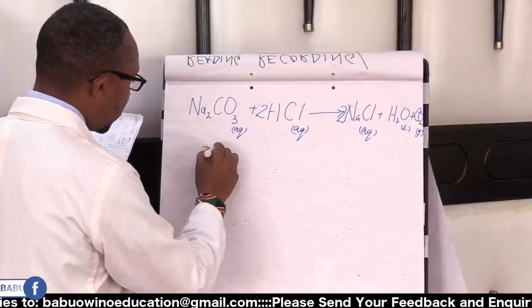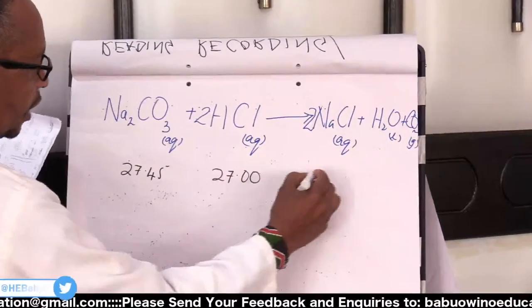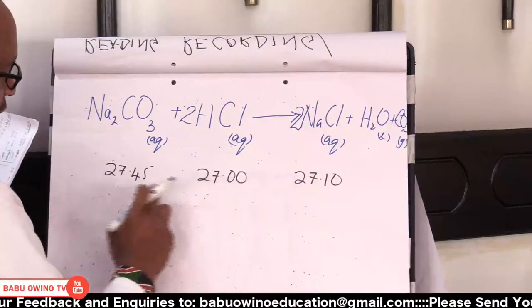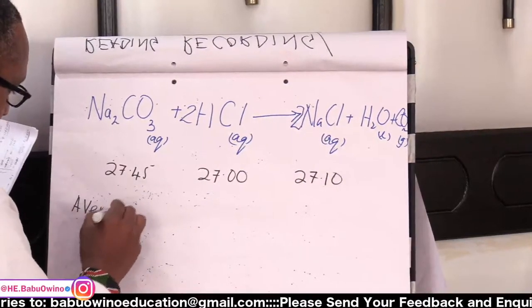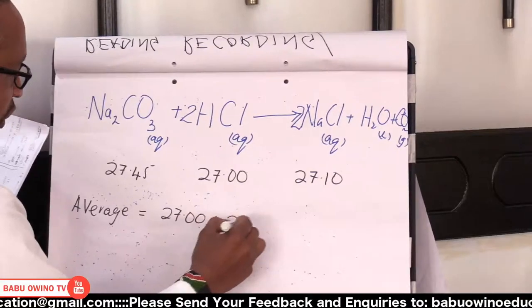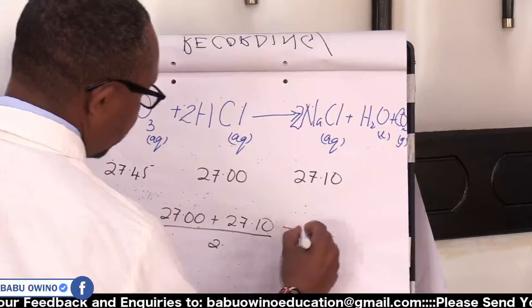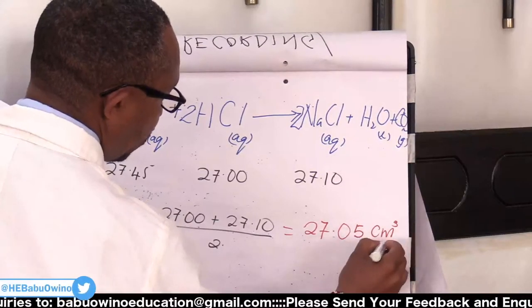The first one was 27.45. The other one was 27.00. Then the other one was 27.10. So these readings, we cannot average the three. We can only average this one and this one. So the average reading is 27.0 plus 27.10. And because there are two, we divide by two. Now, in this case, we are going to get 27.05. Now, this is centimeters cubic.